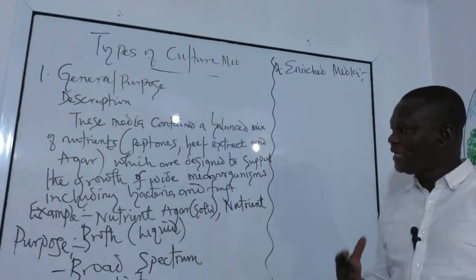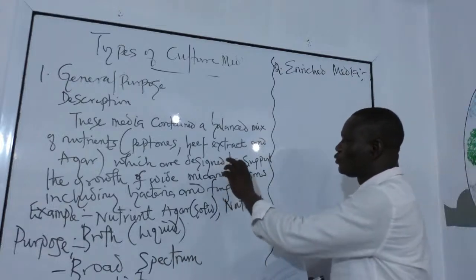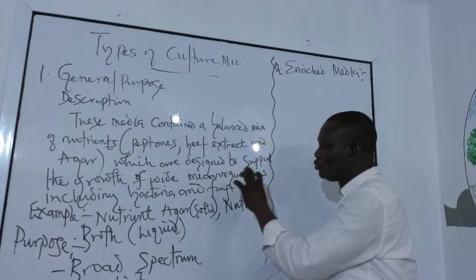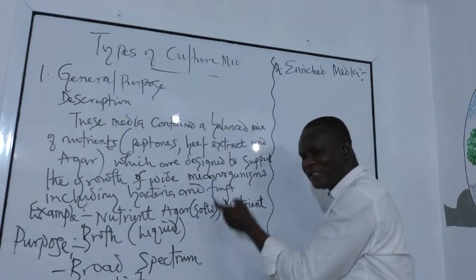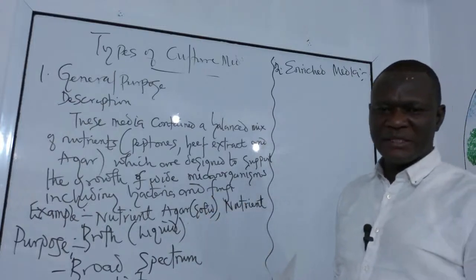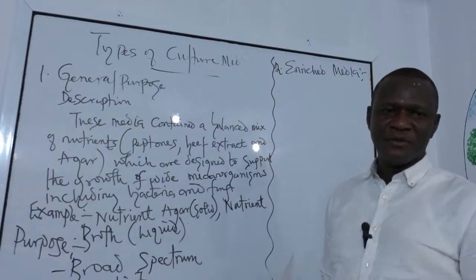So enriched media is that instead of you having a general purpose agar, you now want to enrich the nutrient agar with a source of other nutrients.